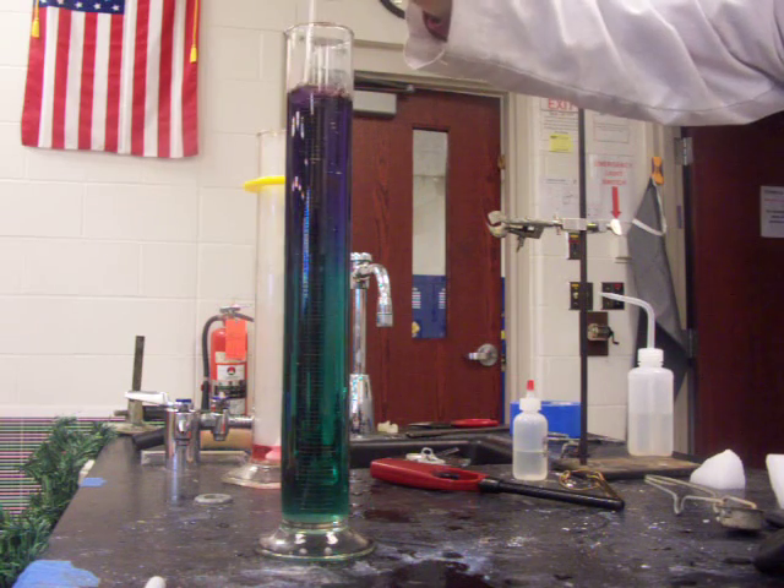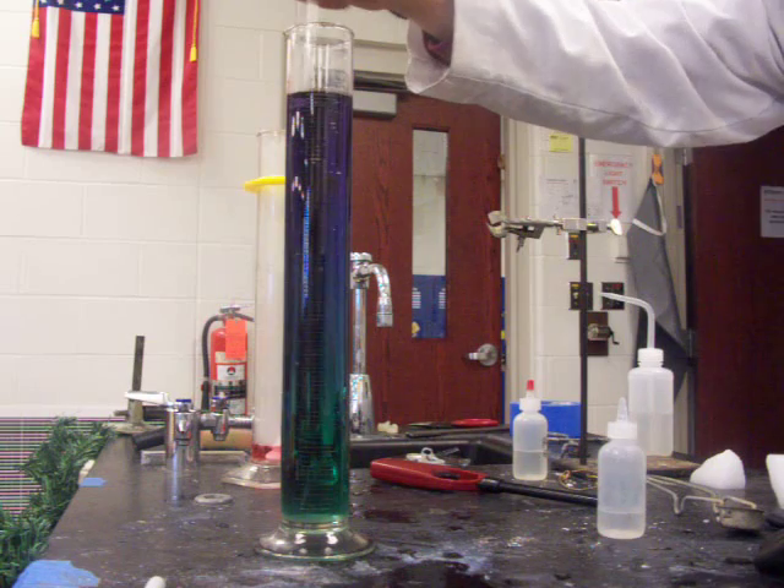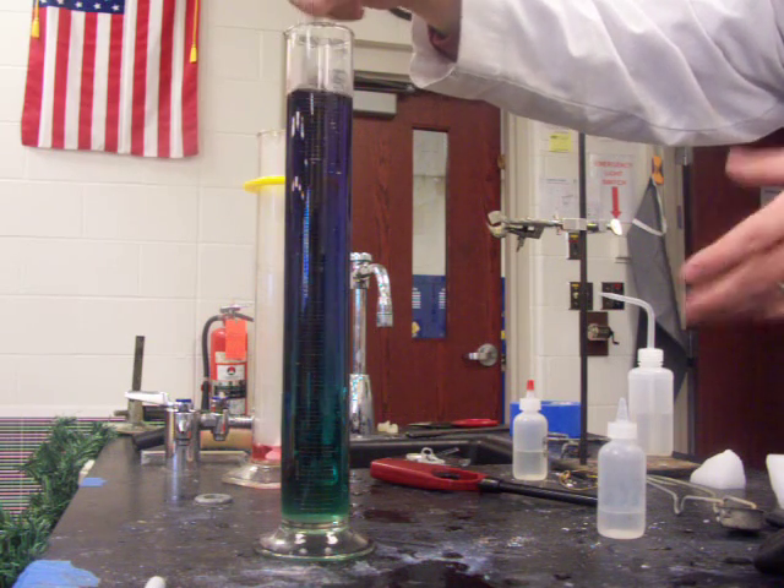With just a little more we should be able to get it out of that teal color into the purple color. My stir rod is not quite long enough to go all the way to the bottom, so I'm not quite getting the color change all the way through.